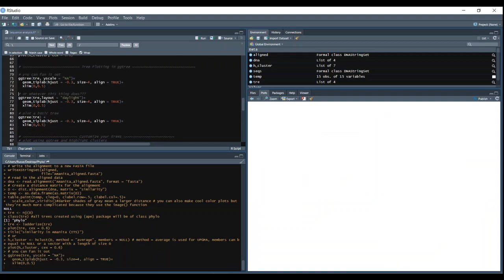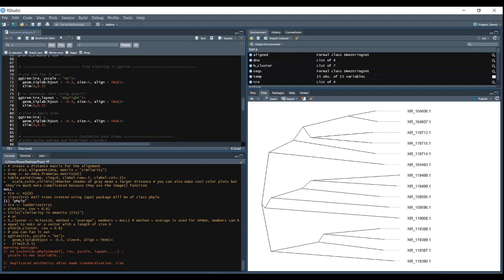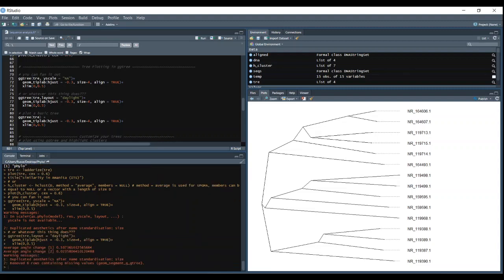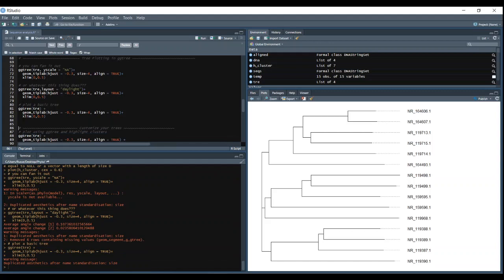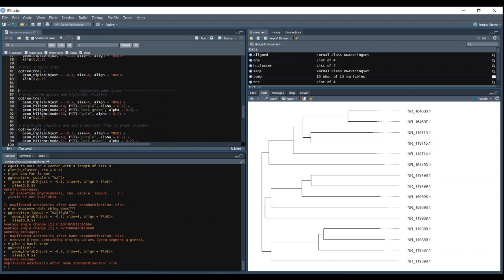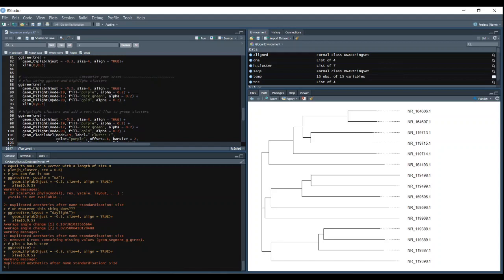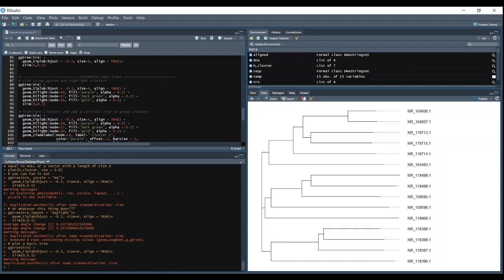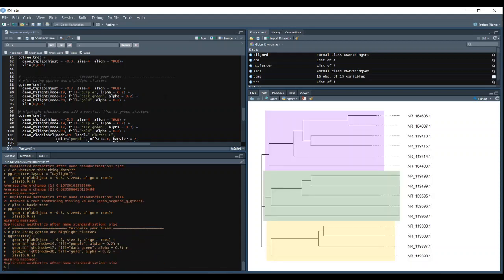And then you can use gg tree. So this is a fanned plot or a daylight plot or just a basic gg tree plot. But the great thing about gg tree is that you can use these extra functions like geom-highlight. Of course you have to specify the nodes for your own data. This is for mine, so it'll only work properly for mine. So this will highlight the clusters. I'm just highlighting based on these three branches.